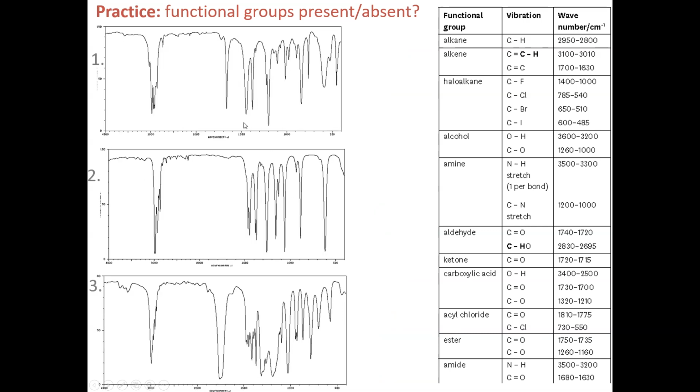So for the last three, pause, work out. Let's have a look. Hopefully you saw this alkene peak. It's a bit hidden over there, but there's an alkene peak over here. It's not that strong finger-like peak. It's a narrow, sharp peak. And we've got quite a lot of strong peaks in the fingerprint region, which makes us suspect a chlorine or a halogen of some sort. So we would look elsewhere to confirm, and we would also look elsewhere to confirm that these are not the case.